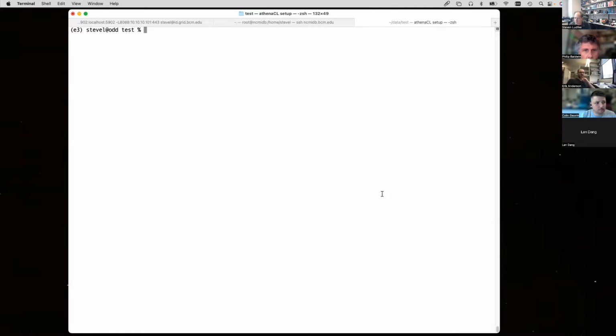What were you asking, Eric? Yeah, so you showed a great workflow of how to make a sphere in the last talk. I understand it could be more complicated, but is there just a way to make regularly spaced lines of X pixel dimensions? Because there is no standard method for drawing lines or circles or boxes or something like that on images in EMAN2.